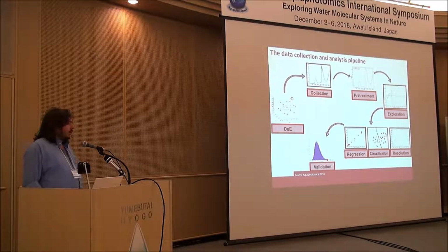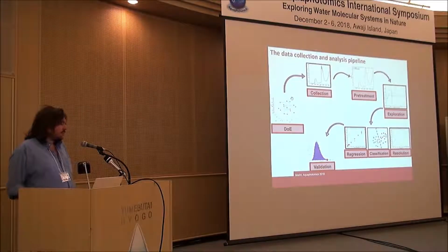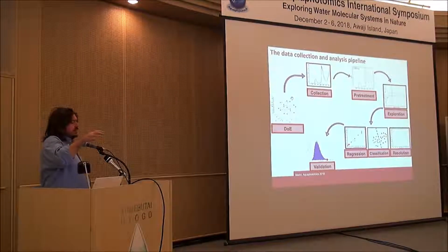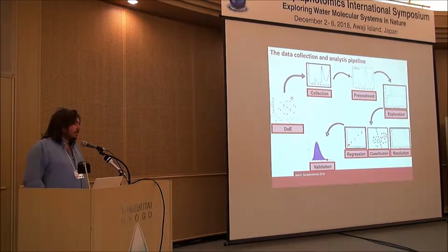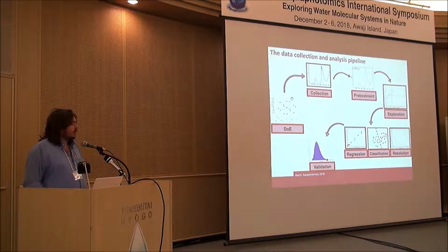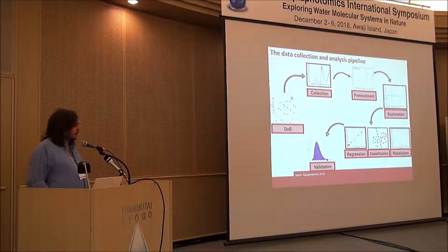Then we need to transform data in order to meet the requirements of the successive analysis that we want to do. And more precisely, we need to use a sort of magnifying lens that puts the focus on the sources of variation that we're interested in, and move as far as possible from all sorts of detrimental, interfering or uninteresting information, or sources of variation, that we may incur once we are considering our experimental data.